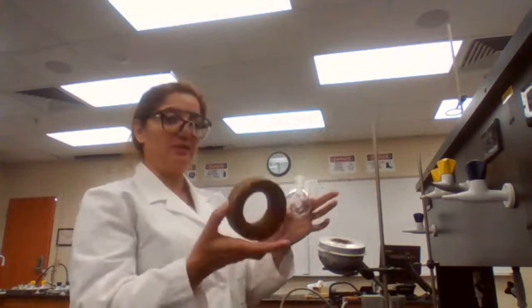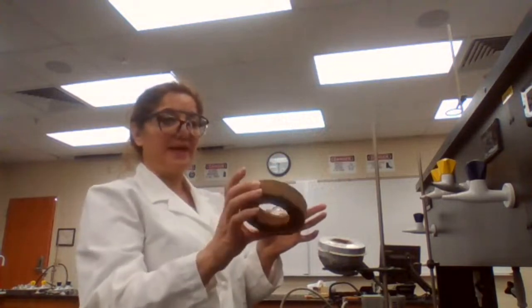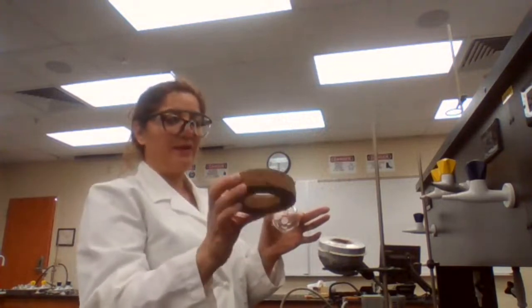The design of the experiment, or the procedure, would tell you what size of flask you are using. When you take the flask, you also have to take a donut that, of course, is not edible. You are going to leave it inside the donut. You should never leave round objects on the surface, because they can roll, drop, and break.